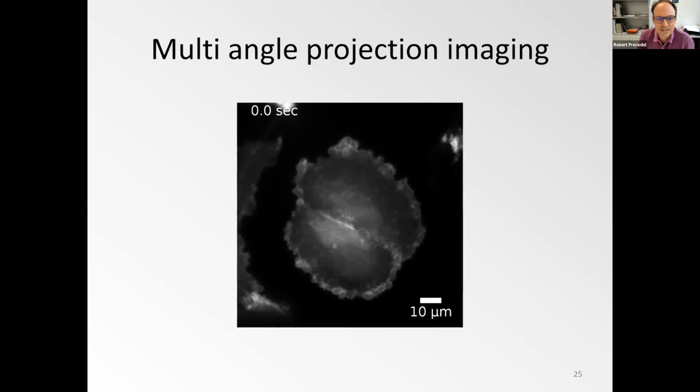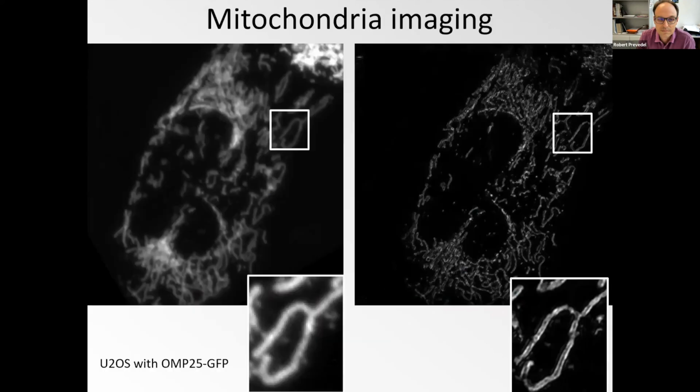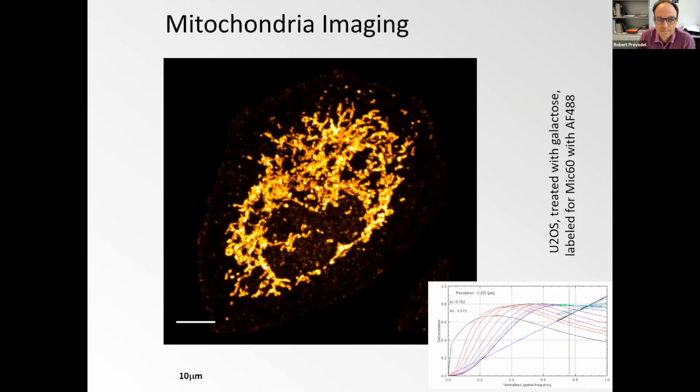On the practical side, you highlighted in the beginning quite a lot how cumbersome it would be with different objectives to create the SIM pattern. Have you thought about the other approach to OPMs, where you come with a second objective from an oblique angle? Would that allow you to also achieve the same type of rotating SIM pattern? Would that help? So you would do OPM, but you would allow a separate excitation objective. It would again be cumbersome, but maybe not so much for the sample anymore.